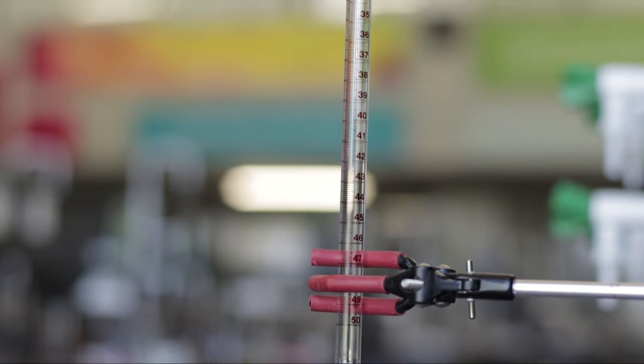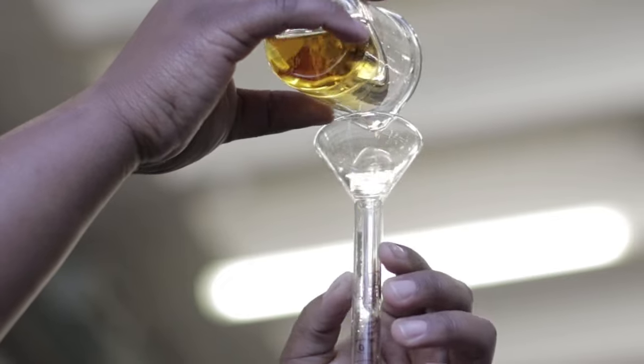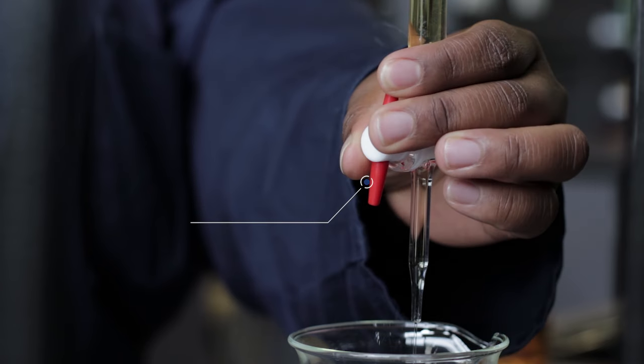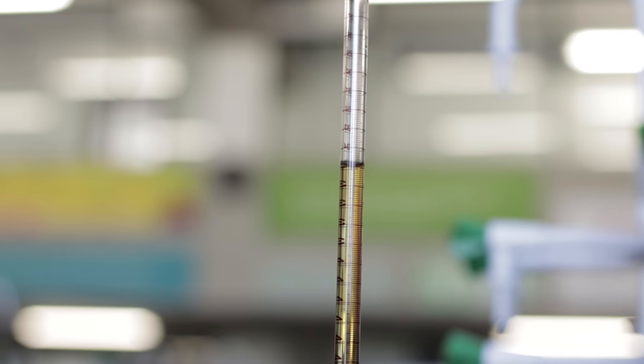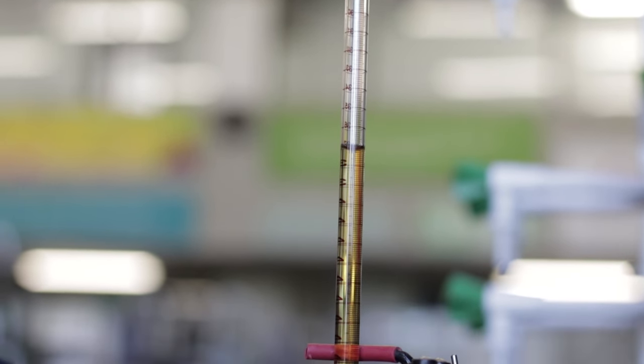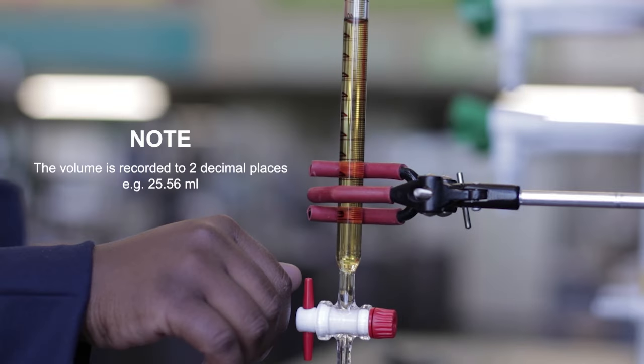A volumetric burette delivers a measured volume of solution. The flow of the liquid is controlled by the stopcock valve. Burettes are available in different sizes. A burette is usually used during a titration. The volume is recorded to two decimal places, for example 25.56 millilitres.